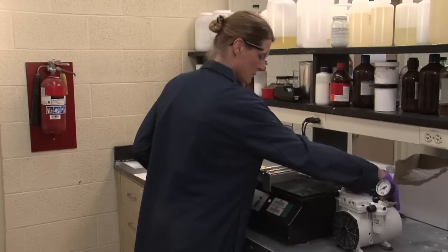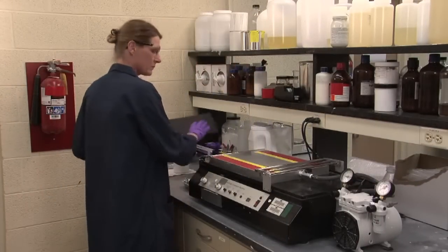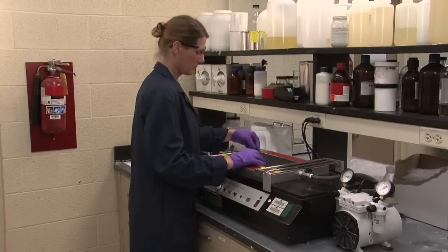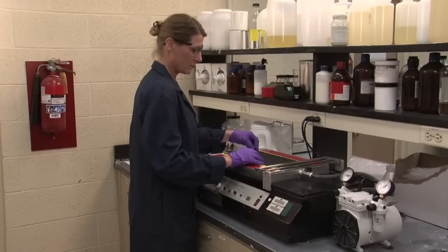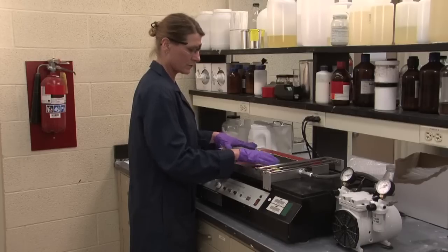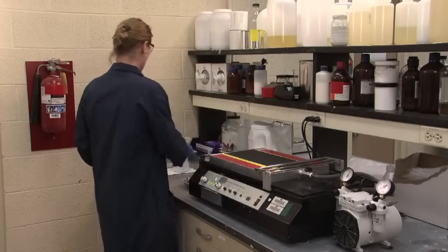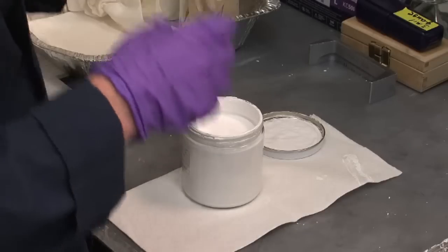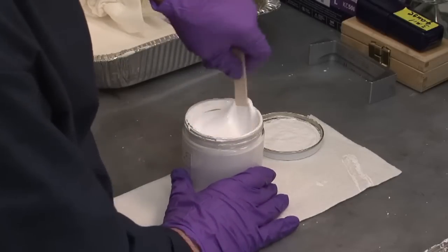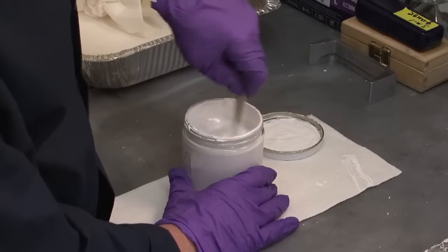We use drawdowns to test the properties of the paint, including gloss, opacity, leveling, sag resistance, washability, scrub and burnish resistance. All these tests are performed in conformance with ASTM procedures.